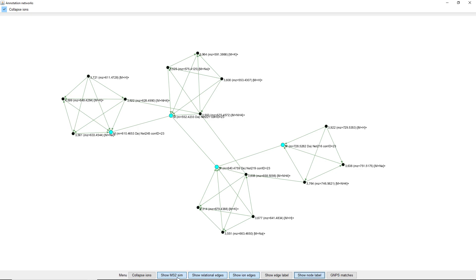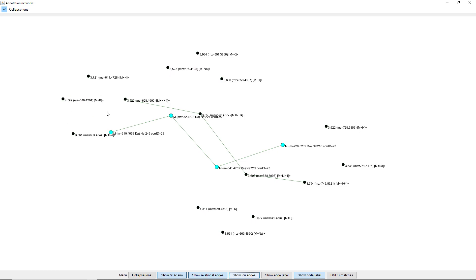The two edge types are actually the MS2 similarity edge and the ion identity network edges. If we turn off the ion edges — because the ion edges are just the Ion Identity Network edges — we can see the MS2 similarity edges more clearly. The similarity edges go from M+ammonium to M+ammonium across the different networks found with Ion Identity Networking, which is based on MS1 information: the feature shape is correlated, the retention time is very similar, and we have a specific delta mass-to-charge ratio.